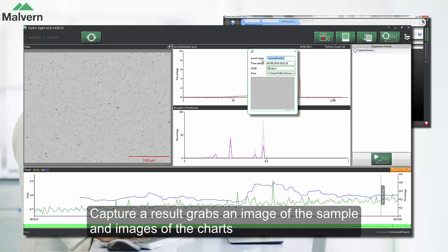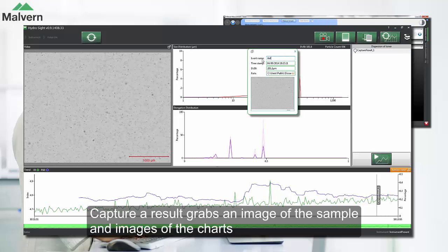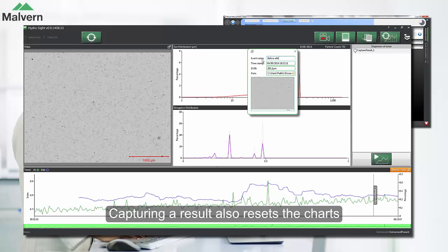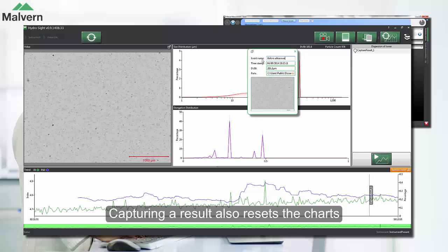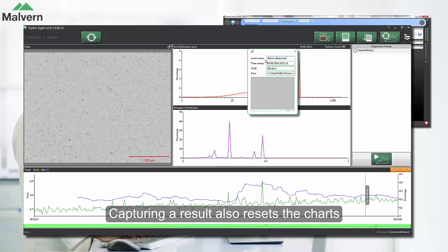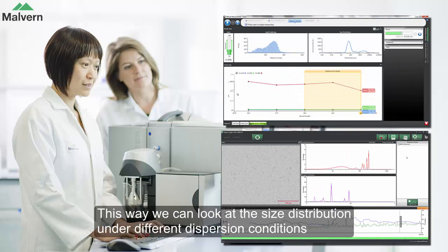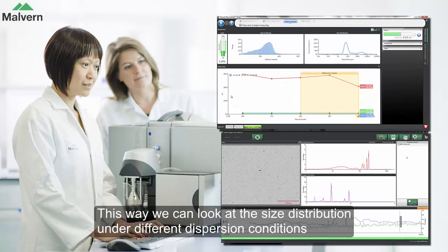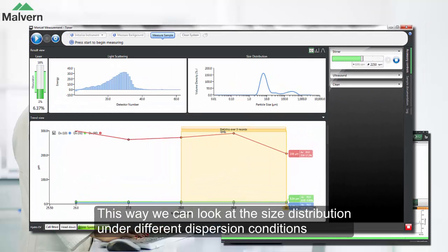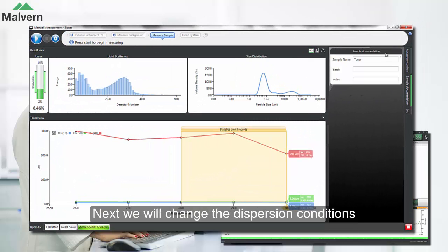We can capture a result, which grabs an image of the sample and images of the charts. Capturing the result also resets the charts, so we can look at how the size distribution changes under different dispersion conditions.